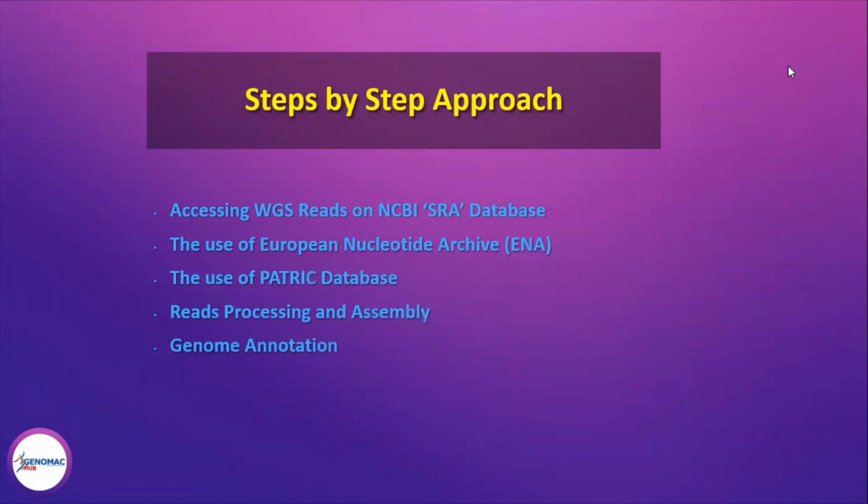We submit the SRA assembled data set, the assembled FASTA contig, to the PATRIC database for genome annotation and then gene prediction. So we'll be evaluating the results of the analysis we have done so far, which include the results for genome assembly and then gene prediction.